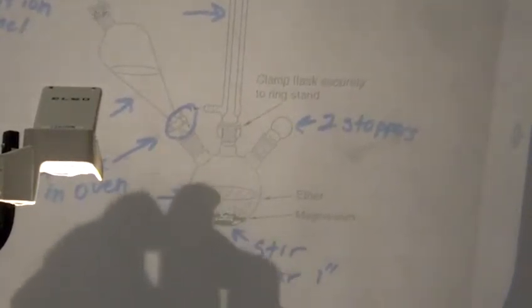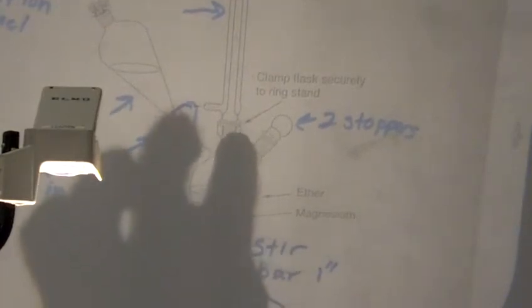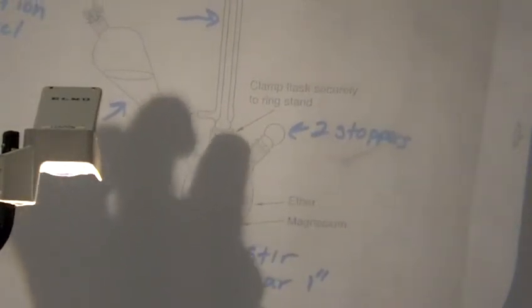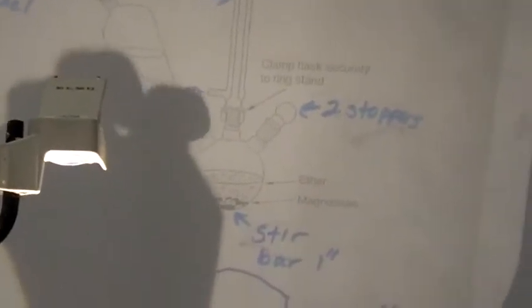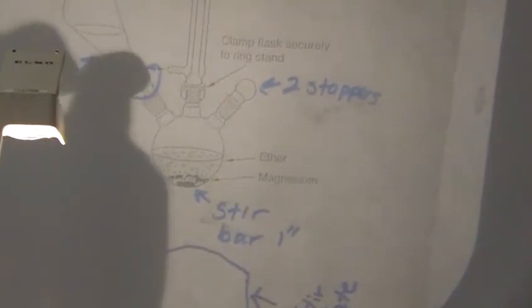You're going to use your 3-neck round bottom flask, clamp on the neck, and then you're going to use your Liebig condenser and clamp loosely on that condenser, okay? Then you're going to have a stopper, a glass stopper here with just a little bit of grease in here so it doesn't get seized with the ether. You're going to have your SEP funnel with, make sure the stopcock doesn't end up in the oven again.